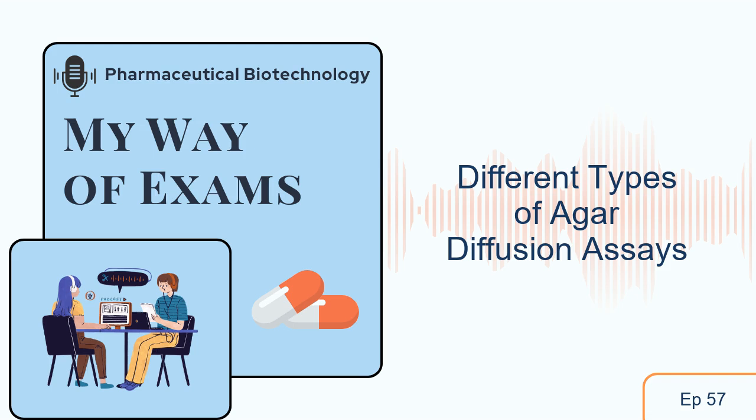So we're talking about agar diffusion assays. These are basically clever ways to see if a substance can stop microbes from growing. Our deep dive is based on a whole bunch of information about different types of these assays, which are super common when scientists are trying to suss out how well something works against those microbes. The basic idea is that we're looking at how a substance spreads through this gel-like material called agar, which has microorganisms on it. And if the substance is strong enough at a certain point, it'll actually stop those microbes dead in their tracks, creating what's called a zone of inhibition.